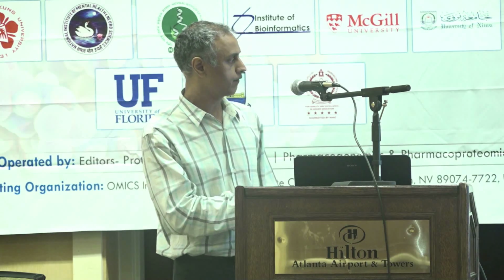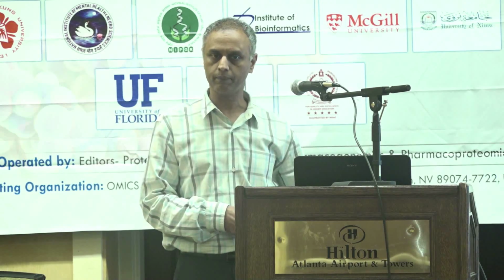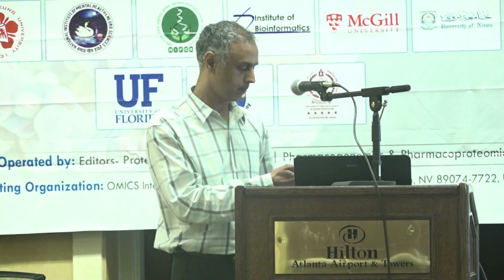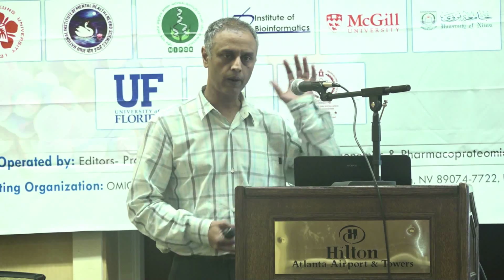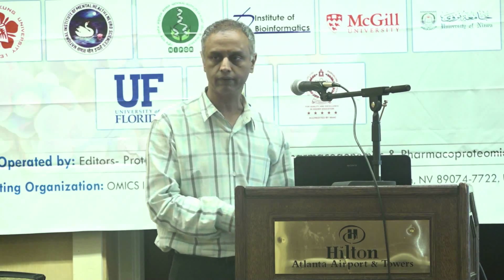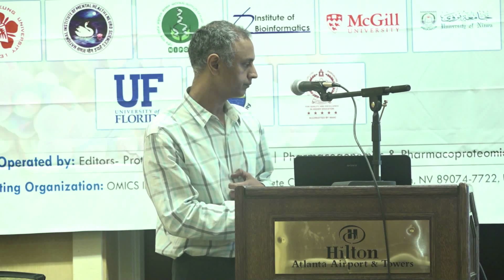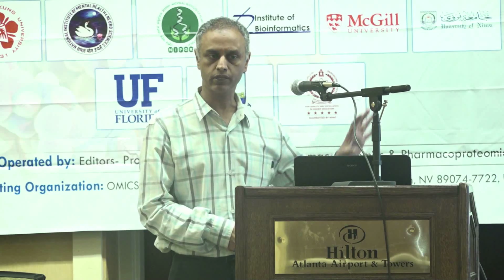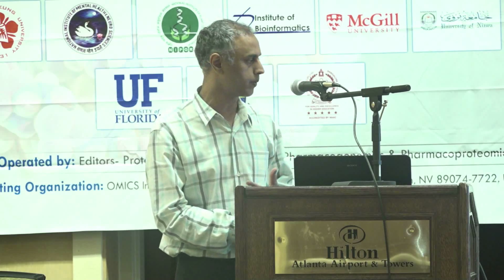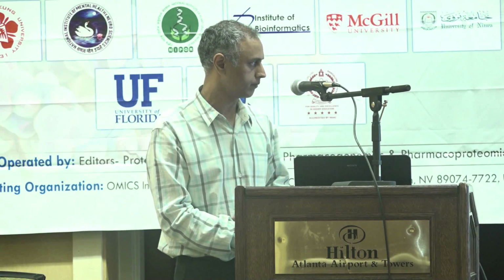So here we have a culture of the microbe. So this is when from a clinical sample, you grow the microbe in a microbiology lab. And here we have a pressure-based lysis. This is a barocycler where we extract the proteins using very high cycling to 45,000 psi back to room pressure, which is about 10 to 15 psi. And then we do a very rapid trypsin digest. So this is still a very conventional workflow for proteomics. We are doing bottom-up proteomics here. We use these high-resolution mass spectrometers, and we are doing sequencing.